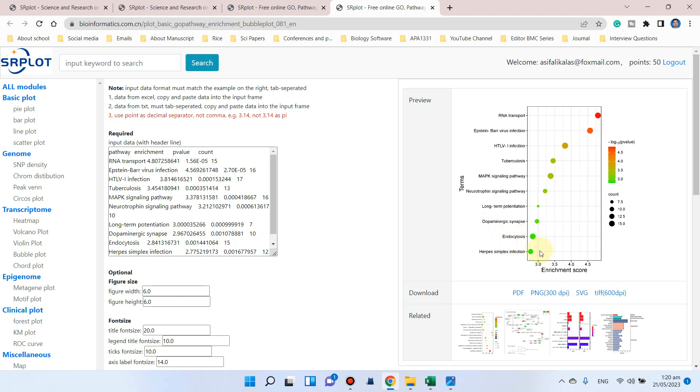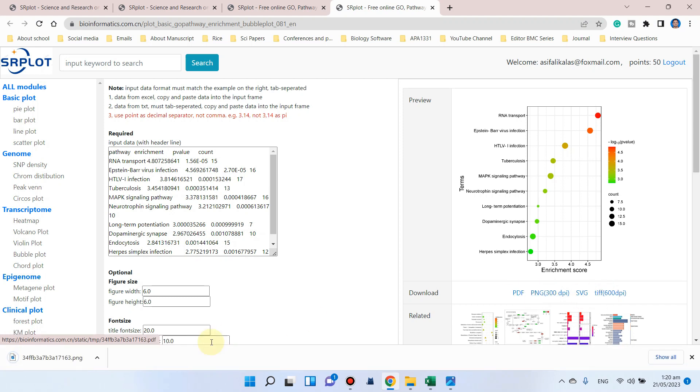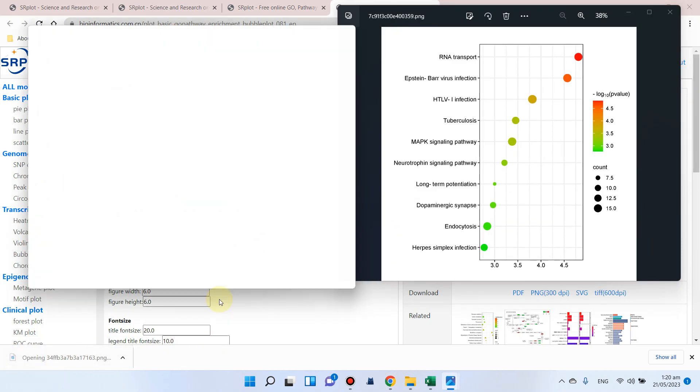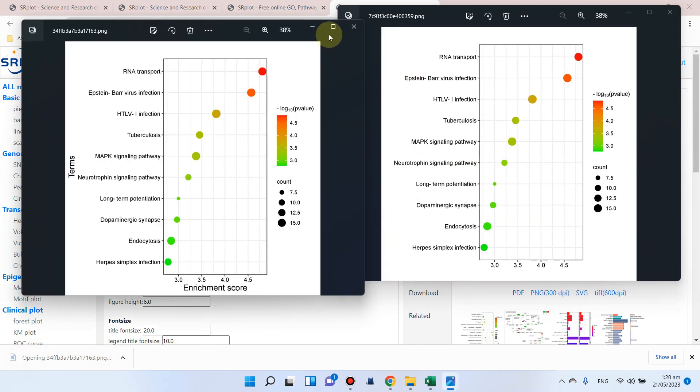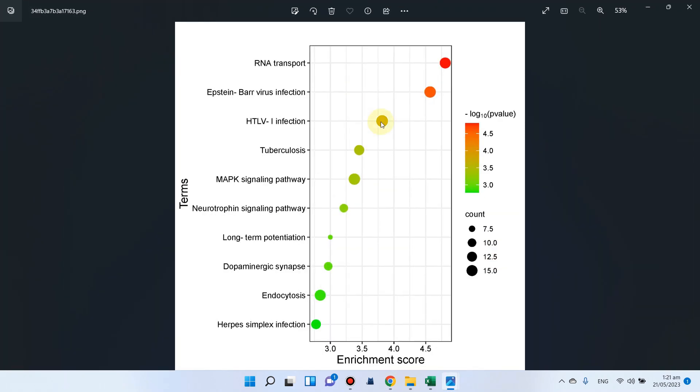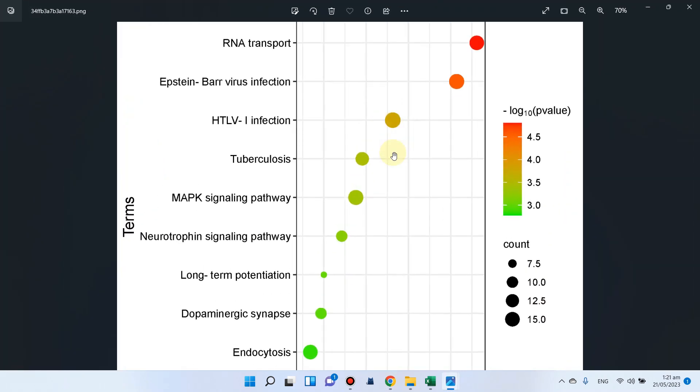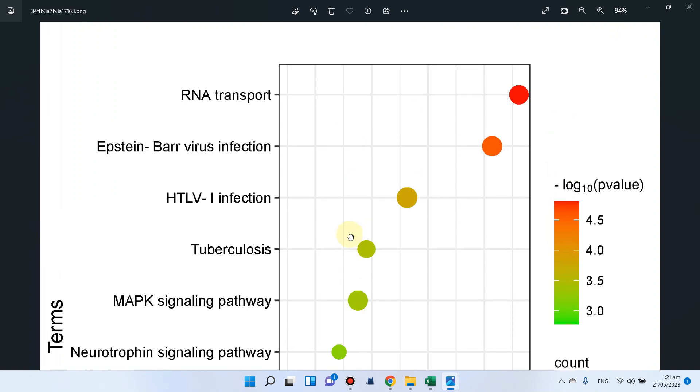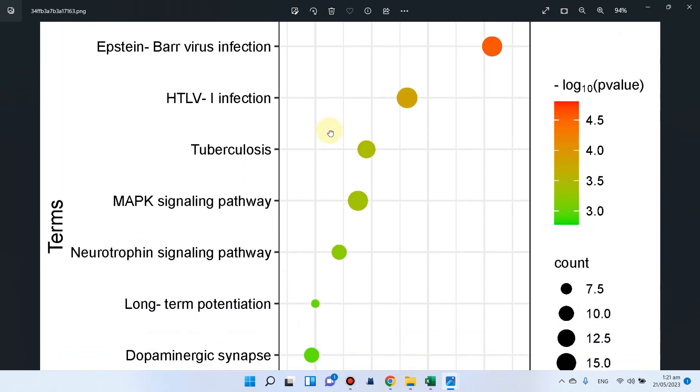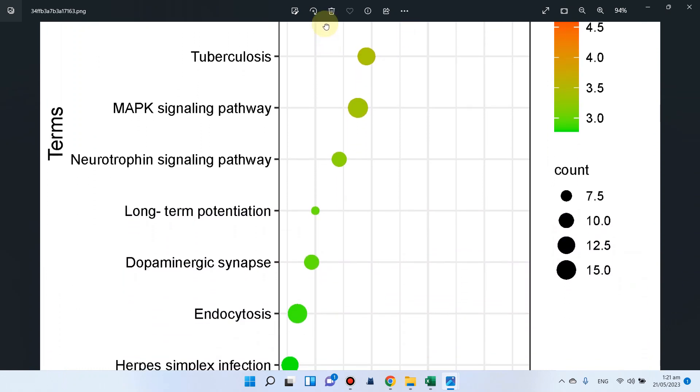Now here you can see a beautiful KEGG pathway has been generated. You can simply download in four formats. Among them, we can select PNG. Here you can see our pathway graph has been downloaded and it is of good quality.